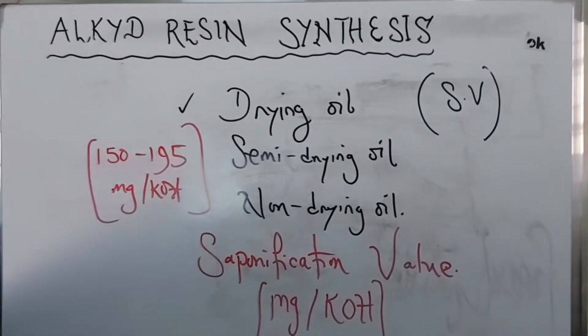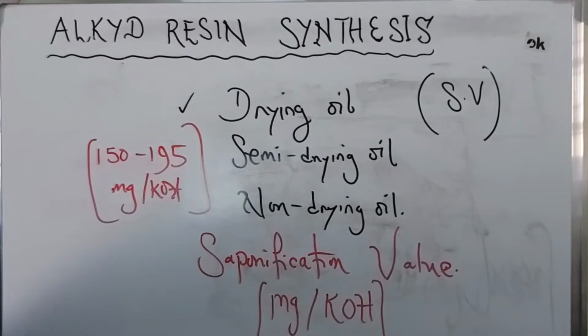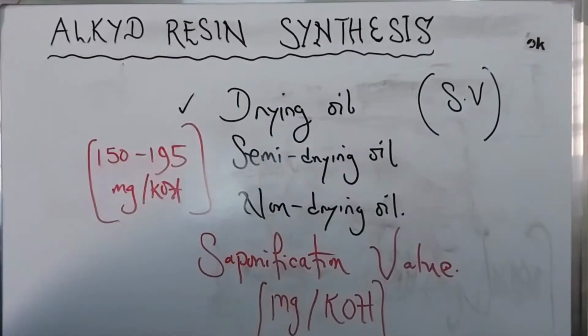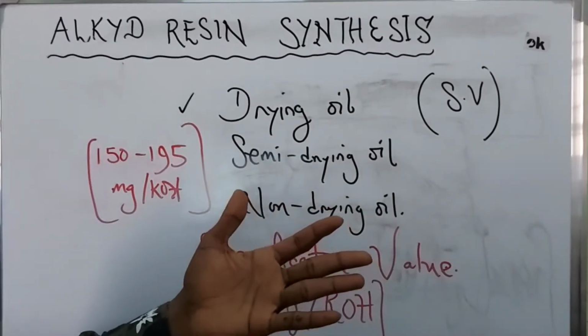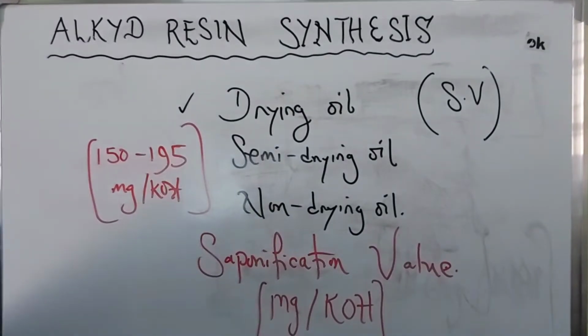I would drop a handout where you can go through some procedures you have to employ to carry out this test. For the purpose of this resin synthesis, we'll be focusing on the actual resin synthesis, what you should do and how to do it, how to measure, how to get the values that are actually measurable to carry out the resin synthesis.